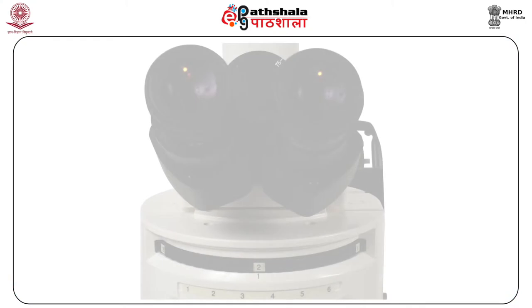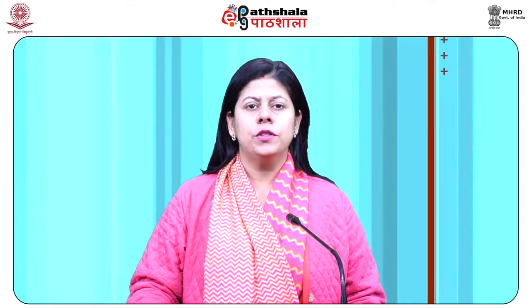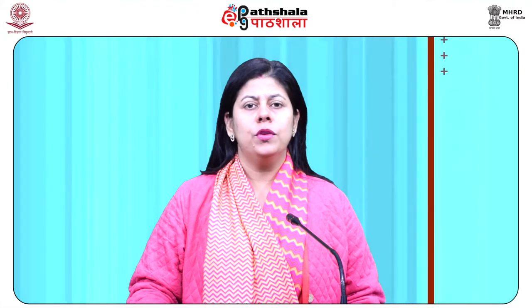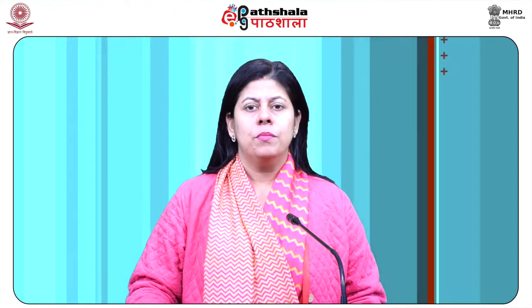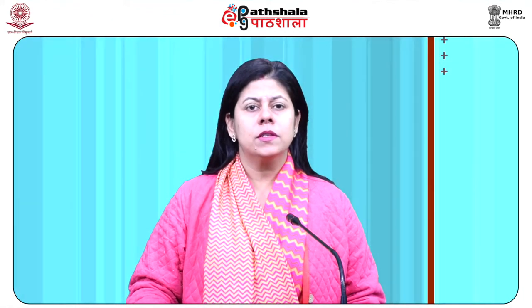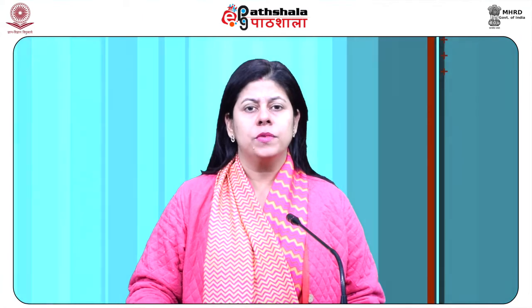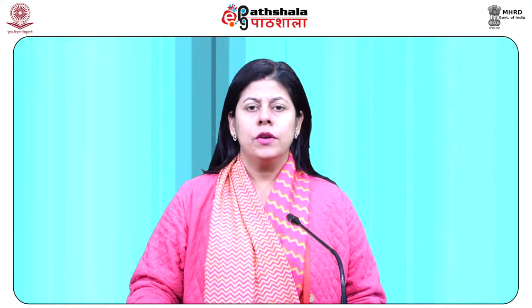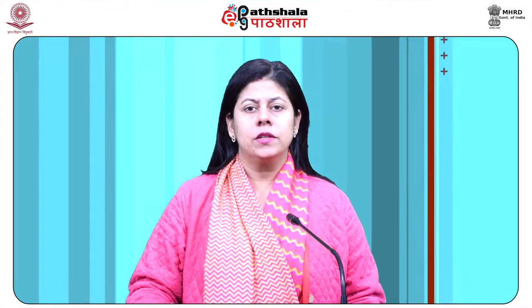Ocular eyepiece. The ocular or eyepiece is a cylinder comprising multiple lenses. Its purpose is to converge the image in focus. The top of the body tube has an eyepiece inserted into it. These eyepieces can be switched with numerous other eyepieces which can be inserted with variable degrees of magnification. Magnification values for eyepieces include 2 times, 5 times and 10 times. Matching of the optical configuration of objective lenses and eyepiece is done in a few high performance microscopes to give optimum optical performance. This happens ordinarily with apochromatic objectives.